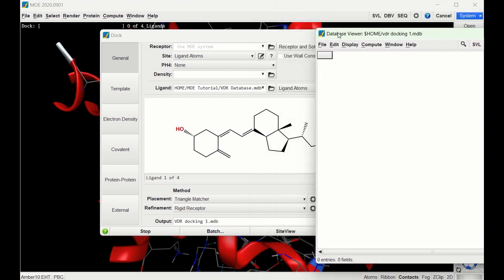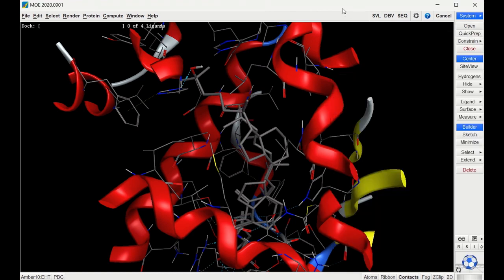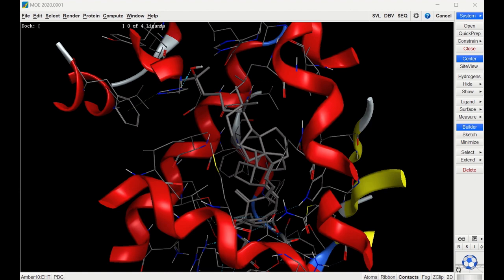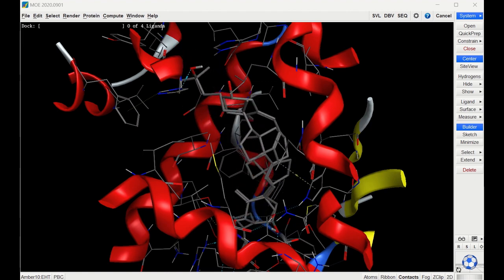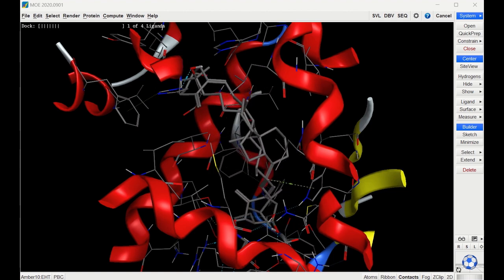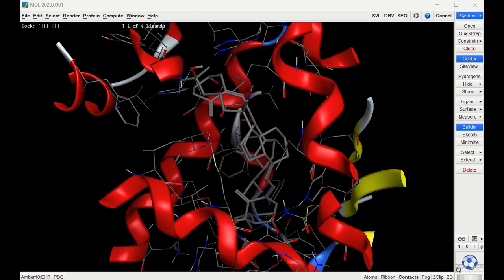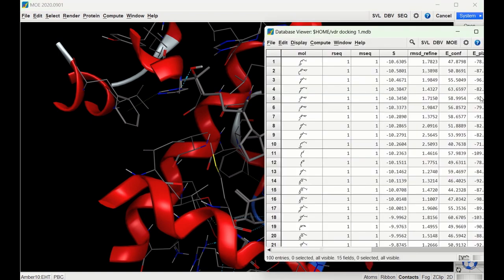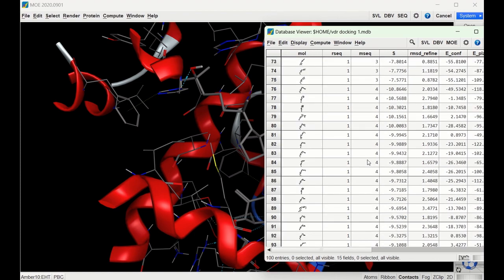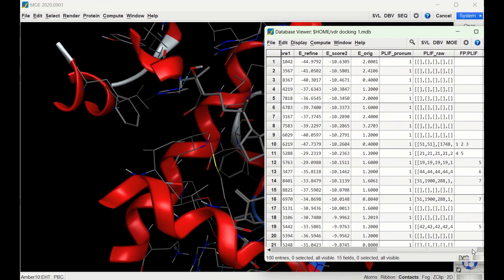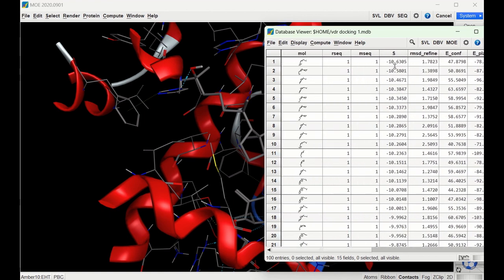A database pops up that will be filled with all the docking scores. You can see how it's throwing the different ligands into the receptor and how they fit. Now that it's done, let's look at the database. We have ligand one with all its different poses, then ligands two, three, and four as we scroll down. The value we care about is the S value, which is the docking score — the greater the negative number, the better the binding.